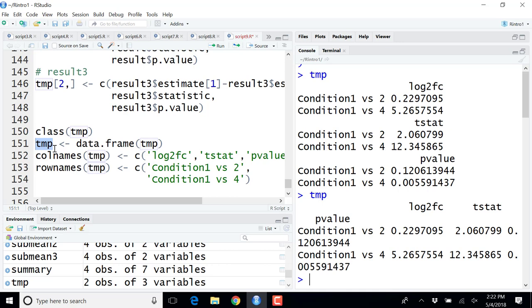So for the data frame, for the first region it is easy to make. We can just assign the number of columns and the number of rows. It's very easy, and then we're going to put the numeric anyway. So that's why I just made it this way. However, if you have some different data, we can actually start with the data frame too. Is it okay so far?